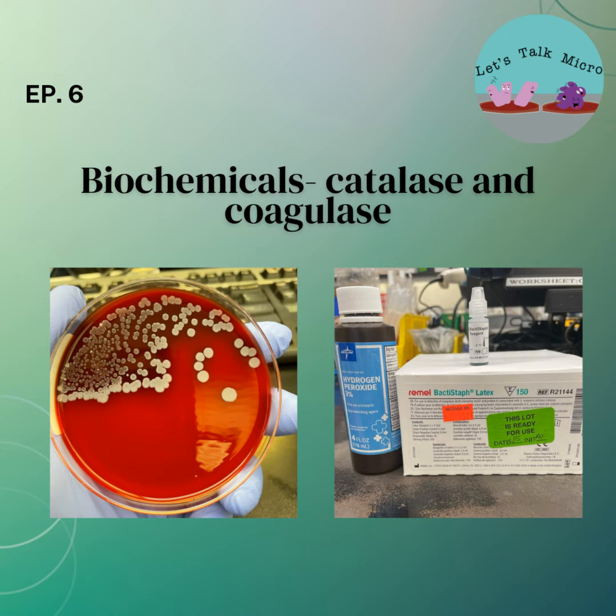So do not assume that just because something is white, it's gram-positive cocci. That's very dangerous. You can make mistakes, you can get in trouble. And most important of all, you can put your patient in danger. There's a different significance of gram-positive cocci versus rods versus yeast. You treat them differently.